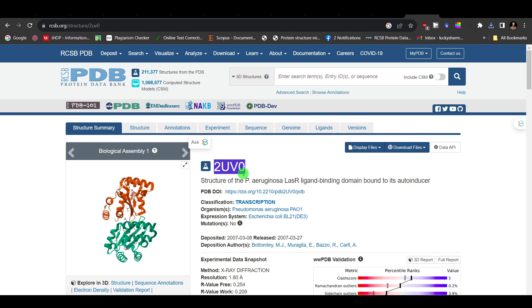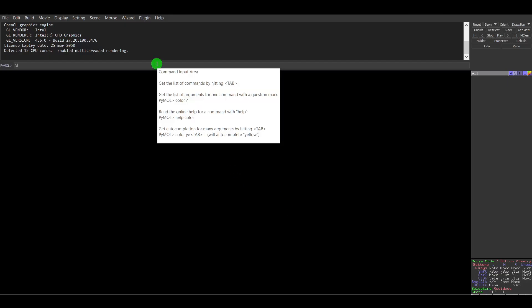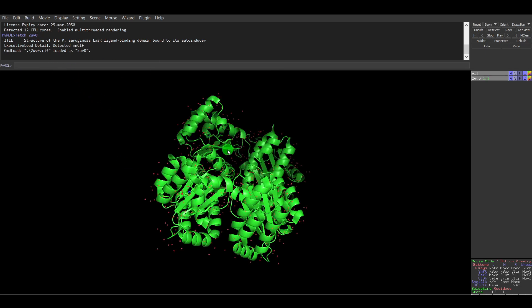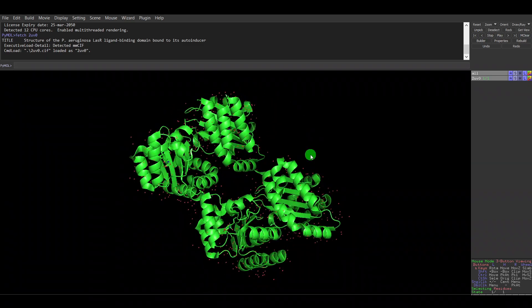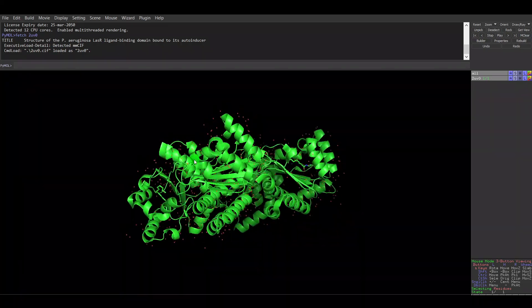Alternatively, you can copy the PDB code — which is 2UV0 in this case — and use the fetch command in PyMOL. Just type 'fetch 2UV0' and press Enter. The structure will be directly imported into PyMOL. You can see this is the ligand binding domain.